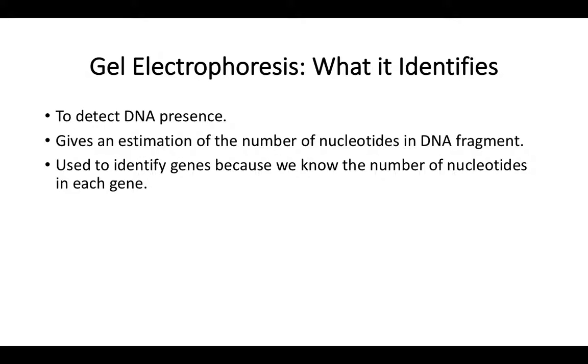The 4 samples that we amplified were the wild type, WACA55, WACA22, and WACA8. Now these 3 WACA genes are going to be compared to the wild type, so we can know which one is a bigger deletion, a smaller deletion, and an insertion. How we would do that is because we know the size of our wee gene, the amount of nucleotides in our wee gene.